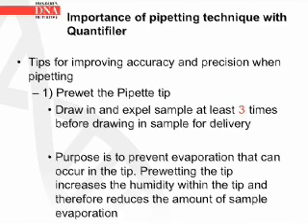Tip number 1. Pre-wet the pipette tip. Draw in and expel the sample at least 3 times before drawing in the sample for delivery. The purpose is to prevent evaporation that can occur in the tip. Pre-wetting the tip increases the humidity within the tip and therefore reduces the amount of sample evaporation.